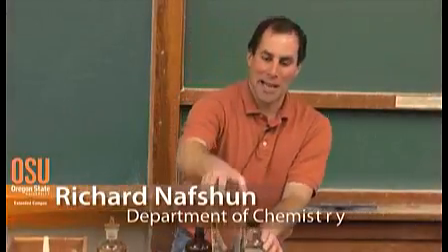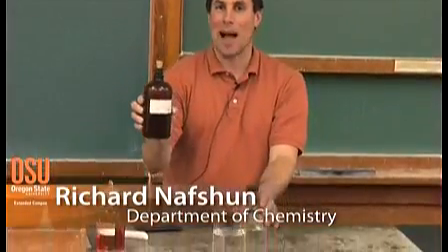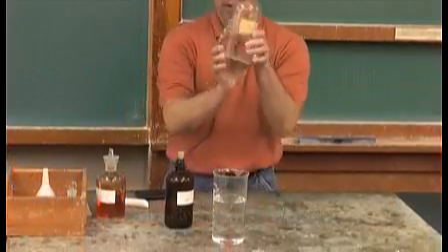Hi, I have a beaker of plain deionized water and a solution containing some potassium iodide. I'll show you the formula and reaction up on the board in a moment, and some lead nitrate.